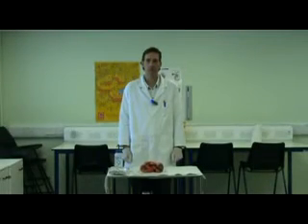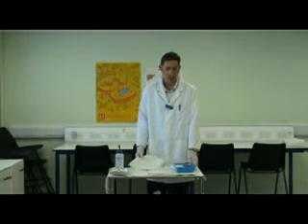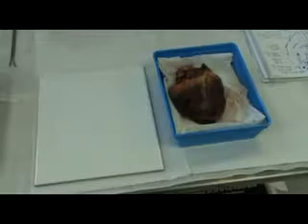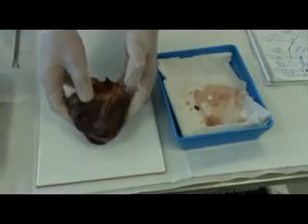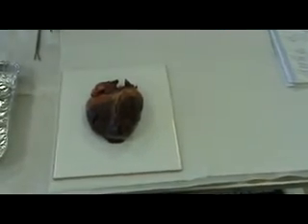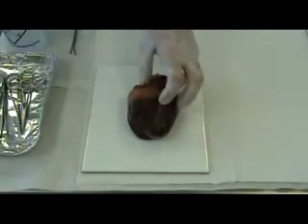This concludes the dissection of the ox heart. We're now going to have a look at a pig's heart, and it's much smaller than the ox heart, and here it is ready for us. Let's lift out the pig's heart and place it on the ceramic tile, and what we need to do is spray it with water, in order to prevent it from drying out. Just a little bit of water.